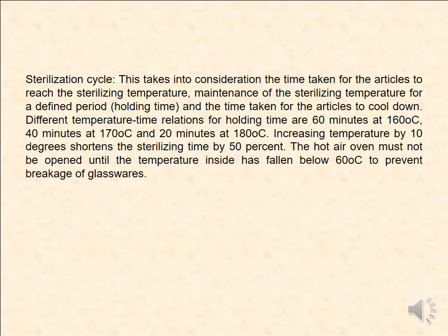Increasing temperature by 10 degrees shortens the sterilizing time by 50%.